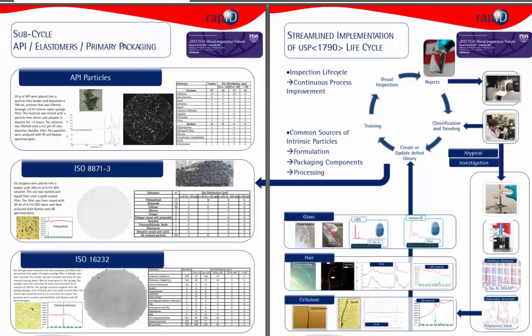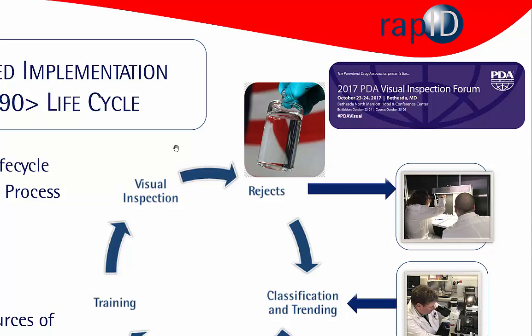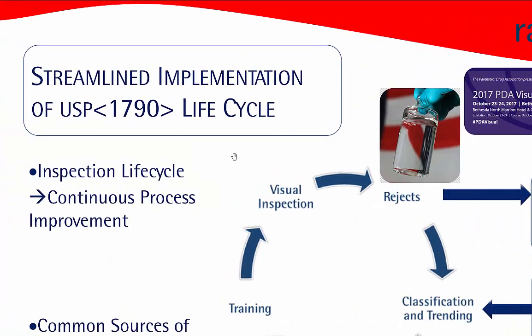Hello, I'd like to walk you through our poster at this year's Visual Inspection Forum. We were presenting our streamlined implementation of the USP 1790 lifecycle.